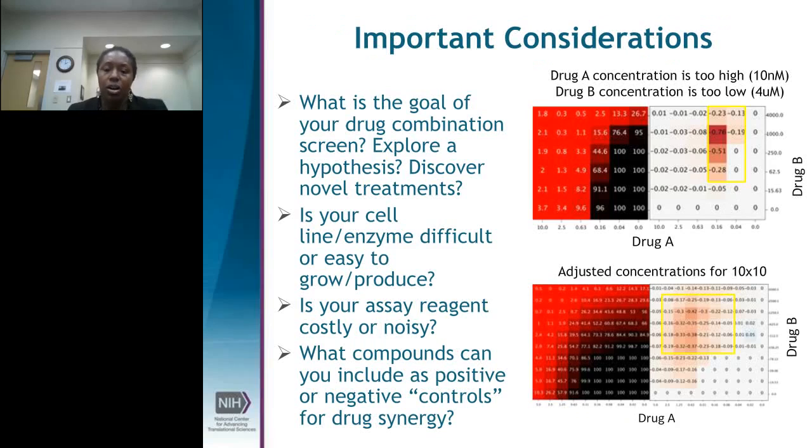And so what are the important considerations before getting started on a screening workflow in this way? One of the major things that I think people underappreciate is you really need to think about what the goal of your drug screen is. Do you have a hypothesis that you want to explore? Are you trying to do drug repurposing? What is the goal, because that is really going to dictate what your screening strategy is and how you'll be able to answer the question that you are aiming for.